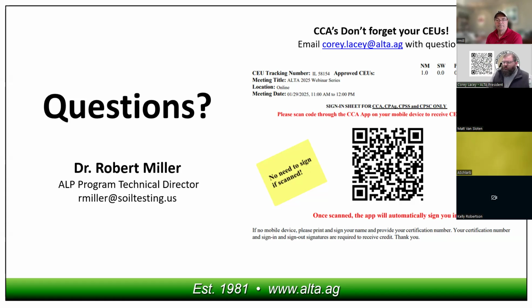All right, great answer. So we're getting some new ones in the chat. Moving down, I find this really interesting because I think in the US we don't think a lot about pH calcium. But what about pH calcium? Is it better than pH water to measure soil salinity? Any thoughts on that? What about soil having pH calcium more than 7 that lies in the range of 7 to 8.5? I'm not fully understanding the question. pH calcium, when we talk, the log of the calcium concentration? I guess maybe I'm misinterpreting it. It says pHCA. That's how I would read that, pH calcium. Or maybe they're talking salt pH.